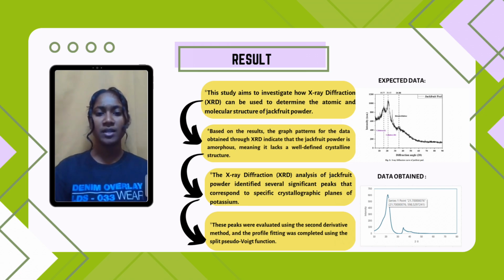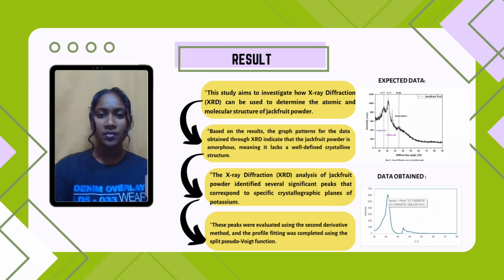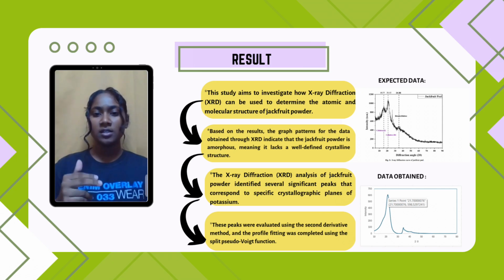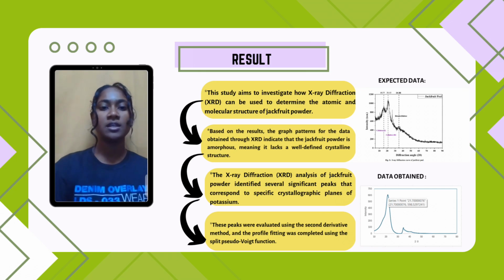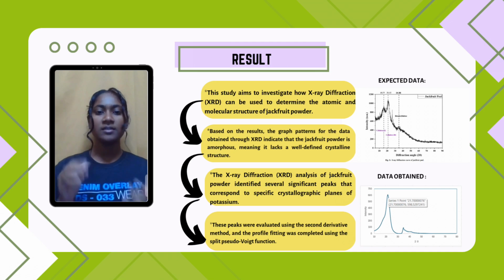Its length ranges from 0.839 millimeters to 2.379 millimeters, and the average length is 1.4775 millimeters. This measurement gives an average aspect ratio of 5.531.